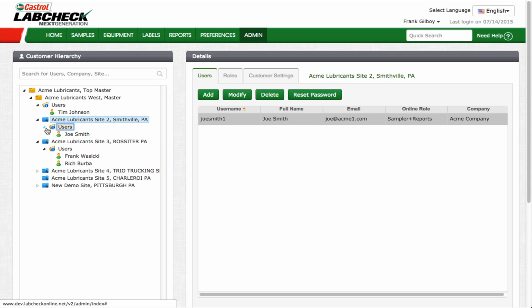The Welcome to Labcheck Online email includes a username and password, instructions on how to log in, as well as a link to the Labcheck Resource Center to view training material. We encourage all of our Labcheck Online users to visit the Resource Center if they haven't already done so.